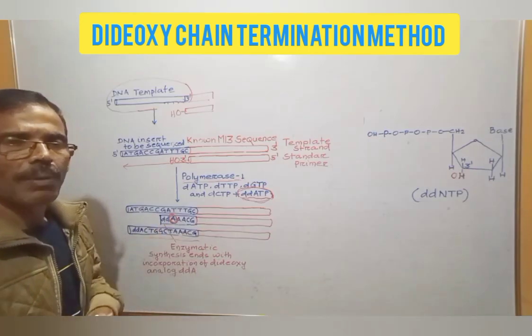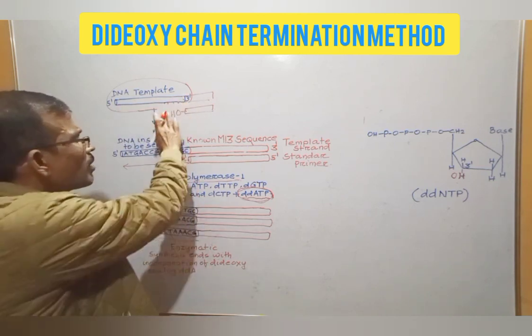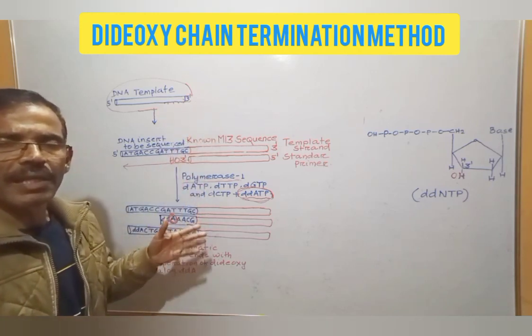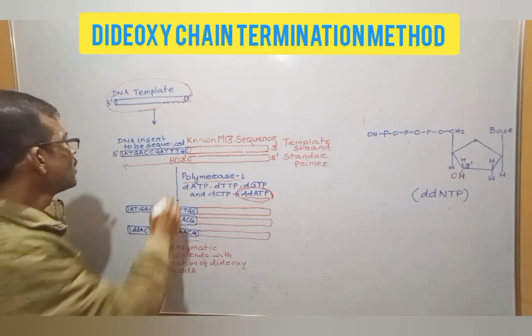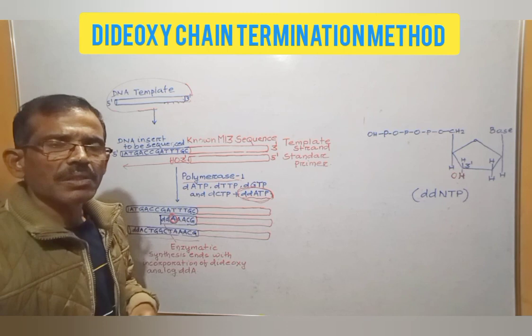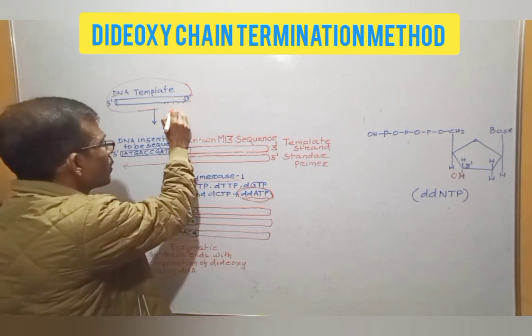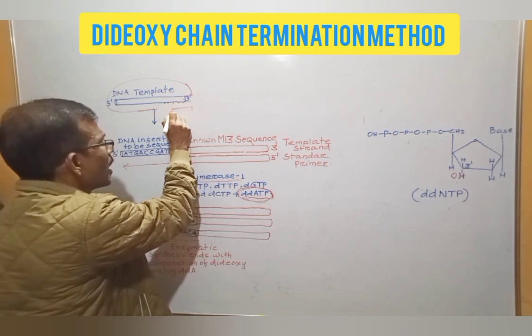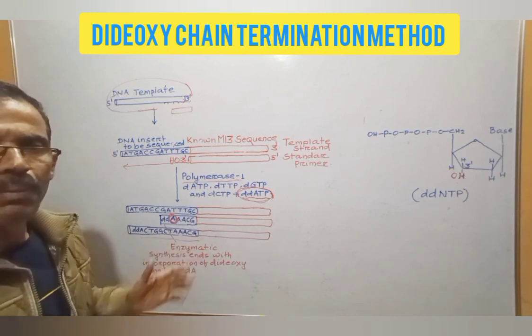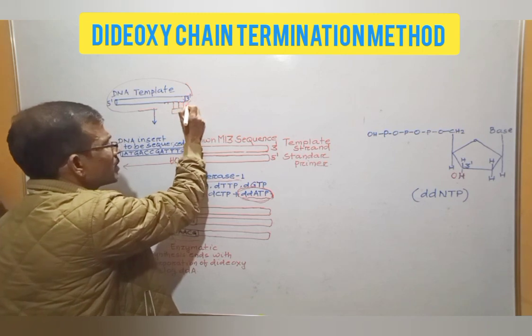Let us discuss the protocol. This is the DNA template. We want to determine its sequence. In order to generate the nested set of DNA fragments, the DNA template has to be replicated. Initiation of replication requires a short primer which is complementary to the 3' end of the DNA template. It is because of base complementarity that the primer will base pair with the 3' end.